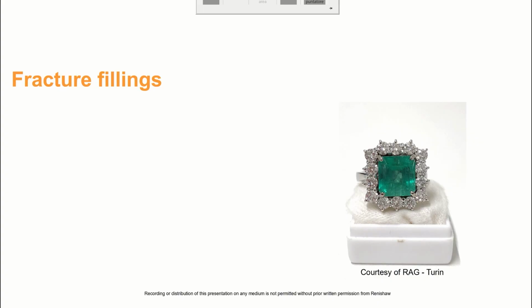I remind you that the spatial resolution of a confocal Raman microscope can go down to 1 micron using a ×100 objective. So the microscope is an ideal tool to study crack fillings and understanding their nature.